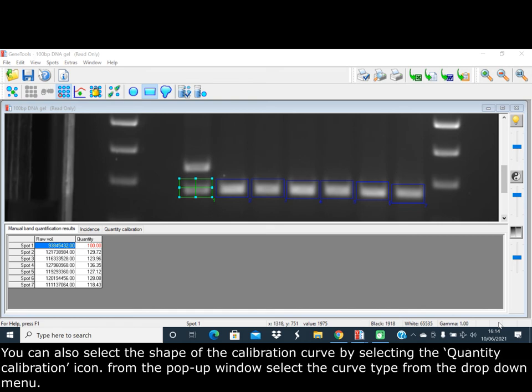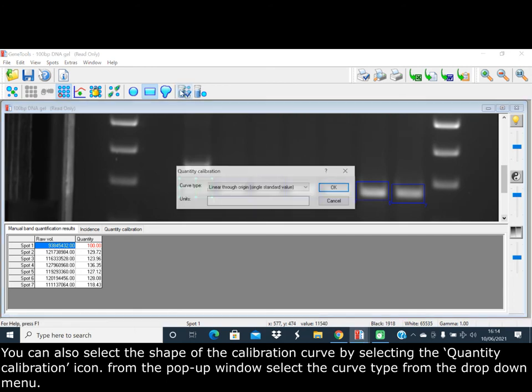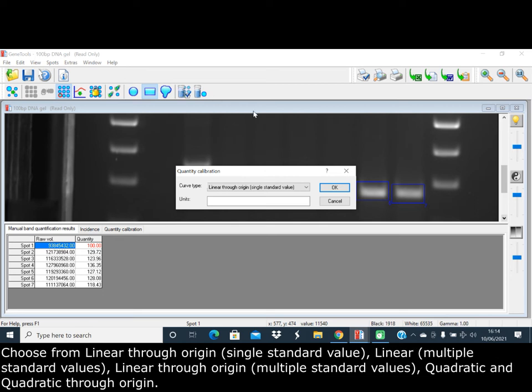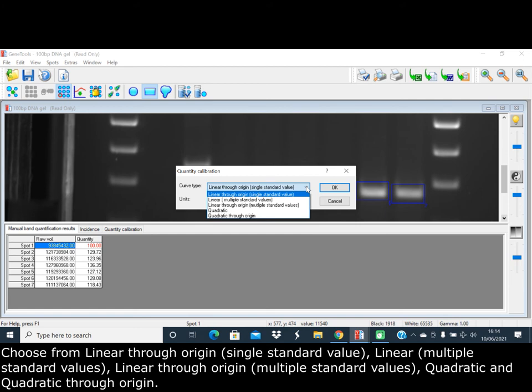You can also select the shape of the calibration curve by selecting the quantity calibration icon. From the pop-up window, select the curve type from the drop-down menu. Choose from Linear Through Origin Single Standard Value, Linear Multiple Standard Values, Linear Through Origin Multiple Standard Values, Quadratic, and Quadratic Through Origin.